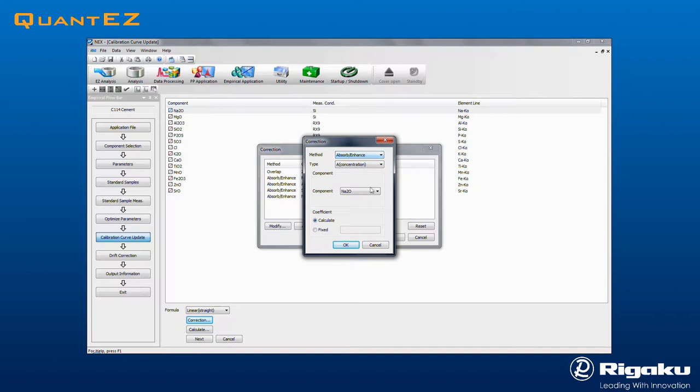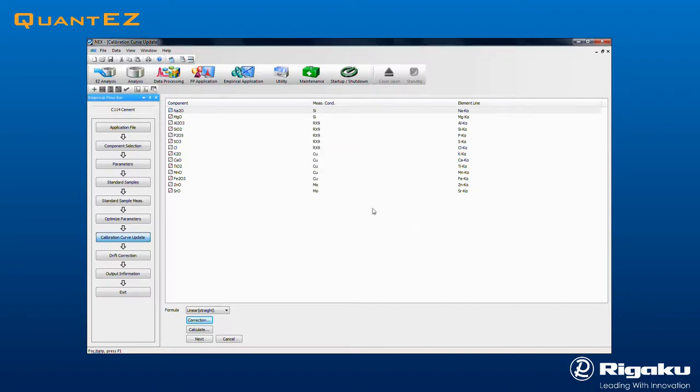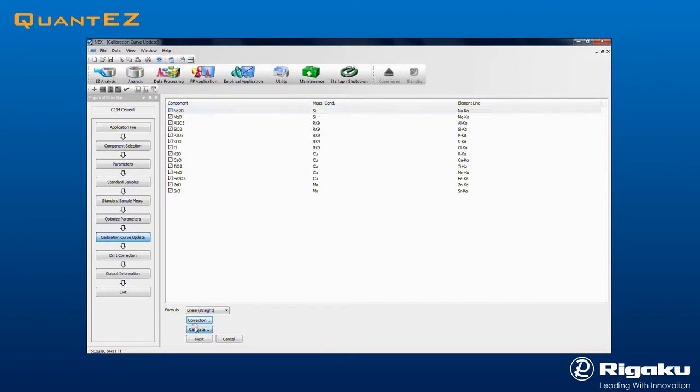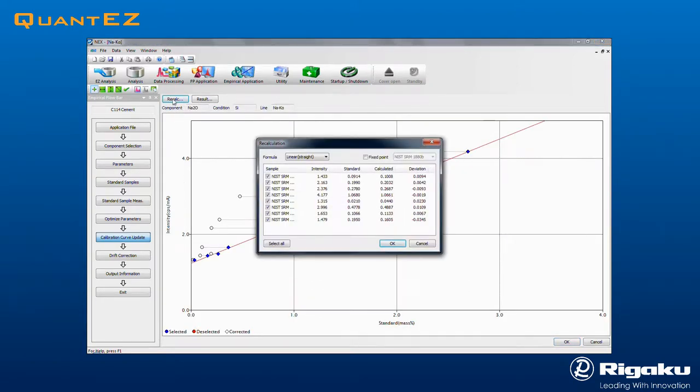To enable a correction, click Add and choose the correction type. To observe a calibration curve, select a component and click the Calculate button.